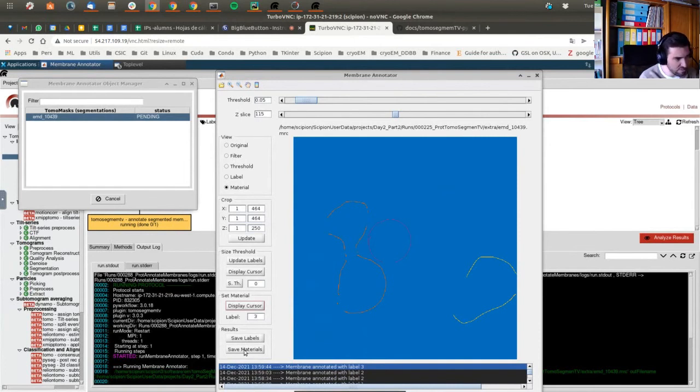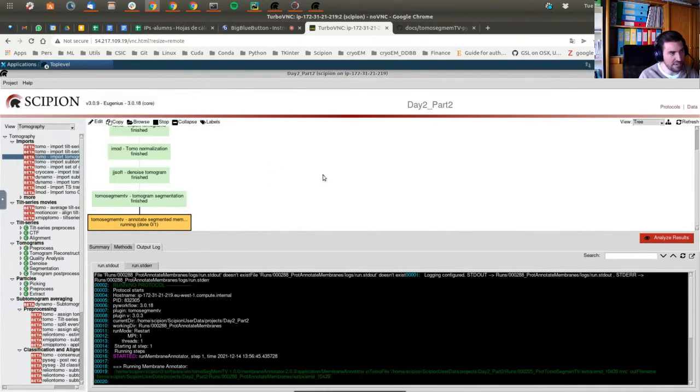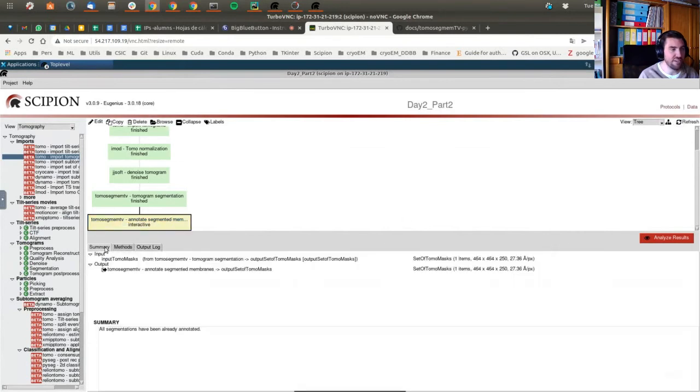So you have to click on Materials. Then here in the log, you can observe materials were correctly saved. At this point, you can close it. And this pending window will change into done. Then you can close this. And let me refresh this. Okay. Now I have finished.